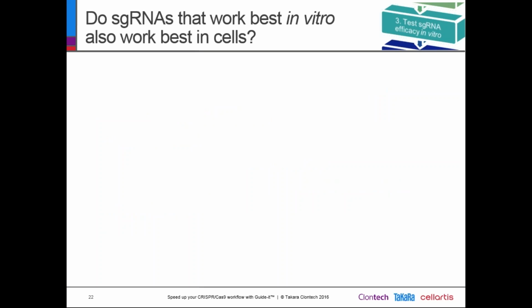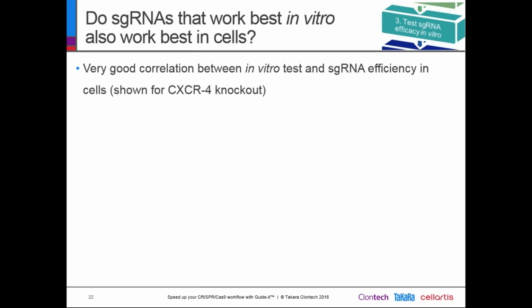The second question you might ask yourself is whether the guide RNAs that work best in vitro will also work best in cells, because it's a quite artificial in vitro assay. And here I would like to show you some data from our R&D which show a good correlation between both tests, in vitro and in cells.